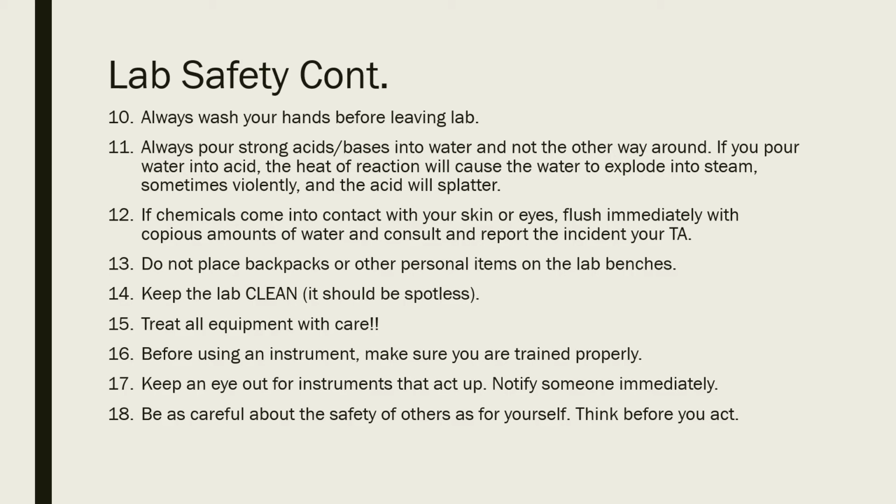Sometimes chemicals will get on your skin, and as much as we want to avoid that, sometimes it just happens. If that ever happens, make sure to flush it immediately with water. If it's just a small amount of chemicals that gets onto your skin, you can always wash it in the sink. For large amounts, we do have a safety shower that's usually on the outside of every lab. And if it ever gets into your eyes, we do have eye wash stations that are usually right by the sink as well.